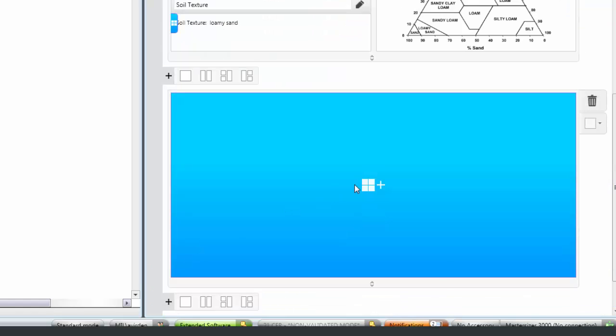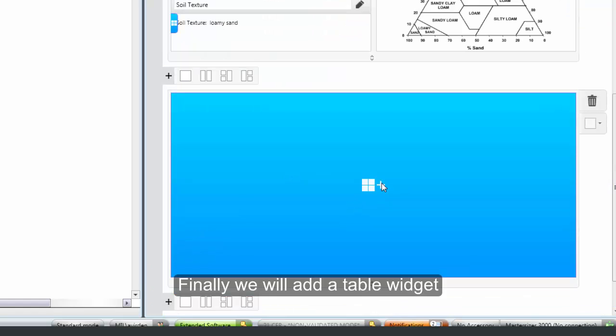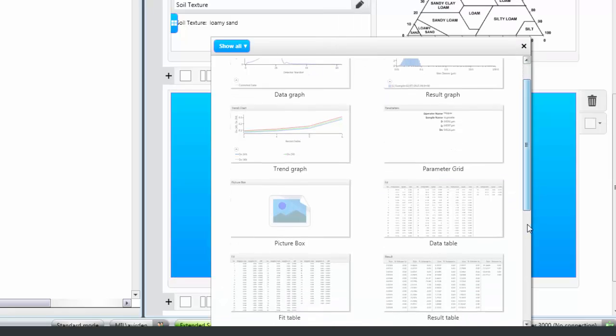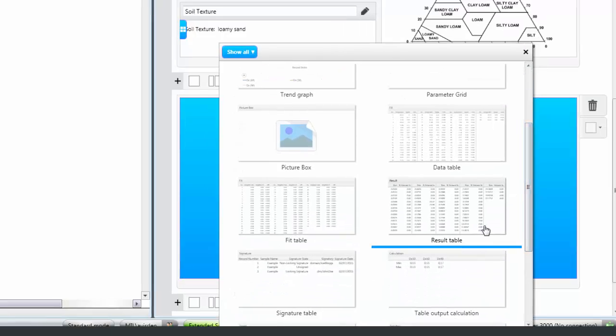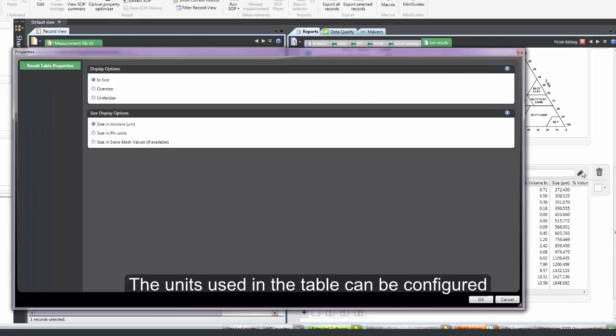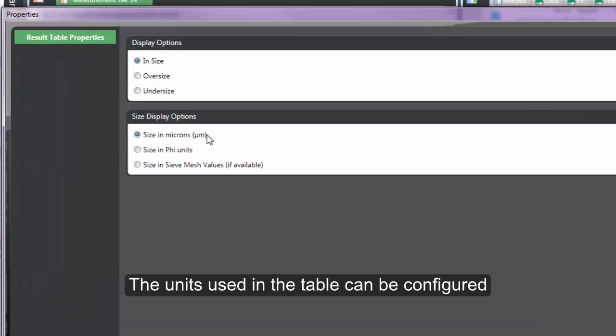Finally I am going to add a result table. And because I am using this report for soils, I will configure the table using the pencil icon to use phi units.